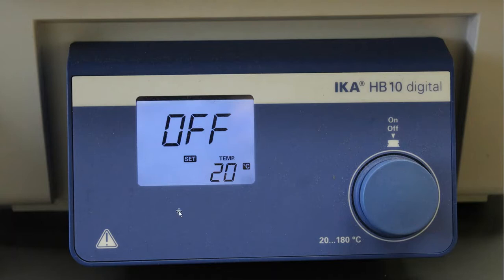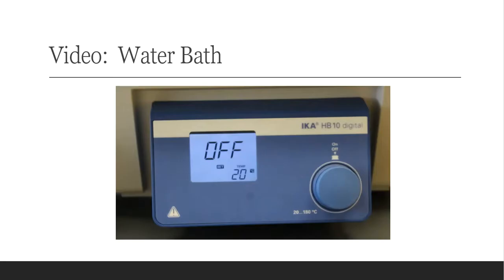So this is what that screen looks like. Right now you can see it's off and it's set at 20 degrees. Notice here's the minimum and there's the maximum temperature that you can set it at. In order to change the number, of course you just grab hold of this knob and turn it left or right. If you want it on or off, you push the button to turn it on, and push it again to turn it off. It's as simple as that. That's all that you need to do with it. So here's me dialing in the appropriate temperature for this particular extraction.